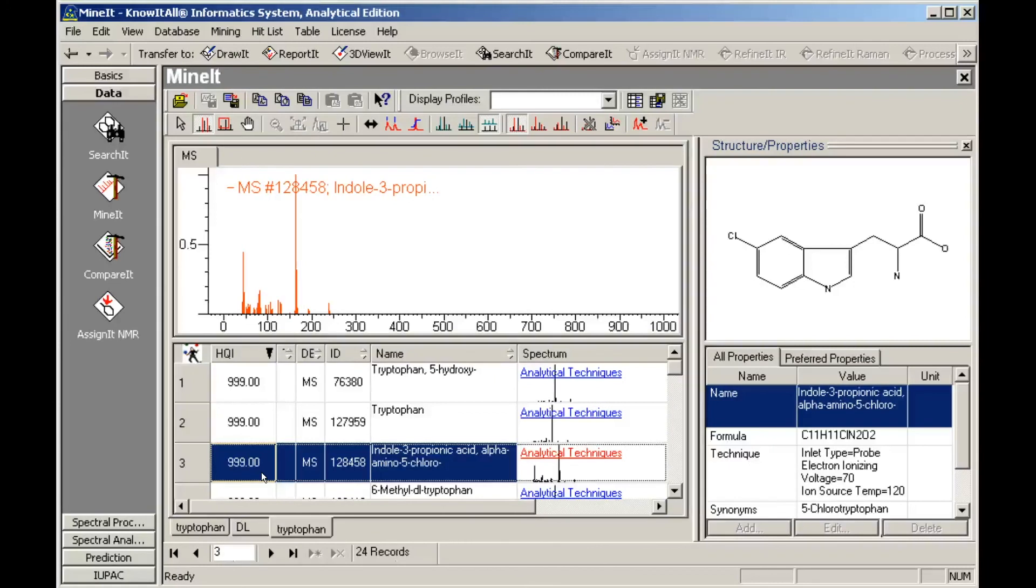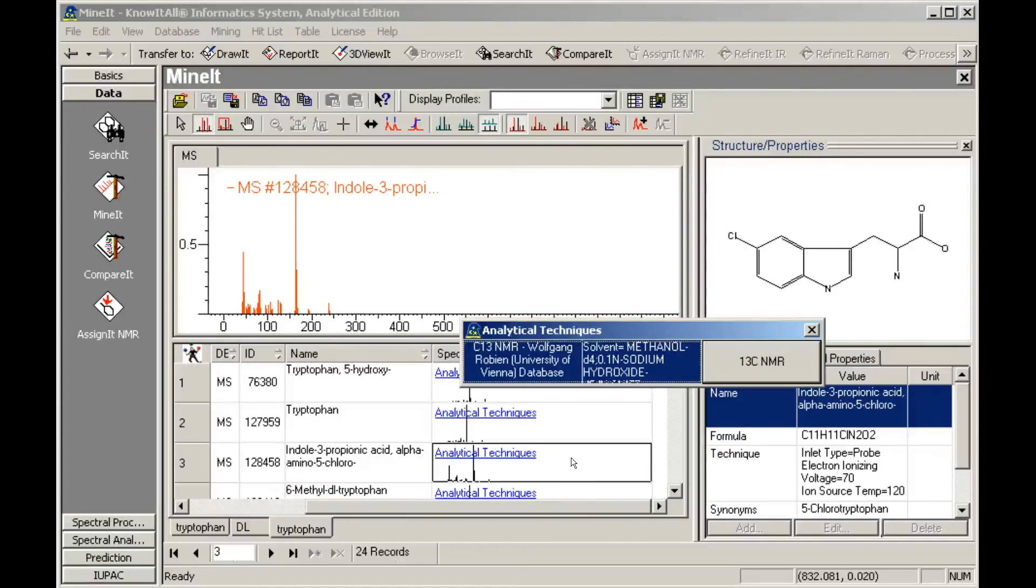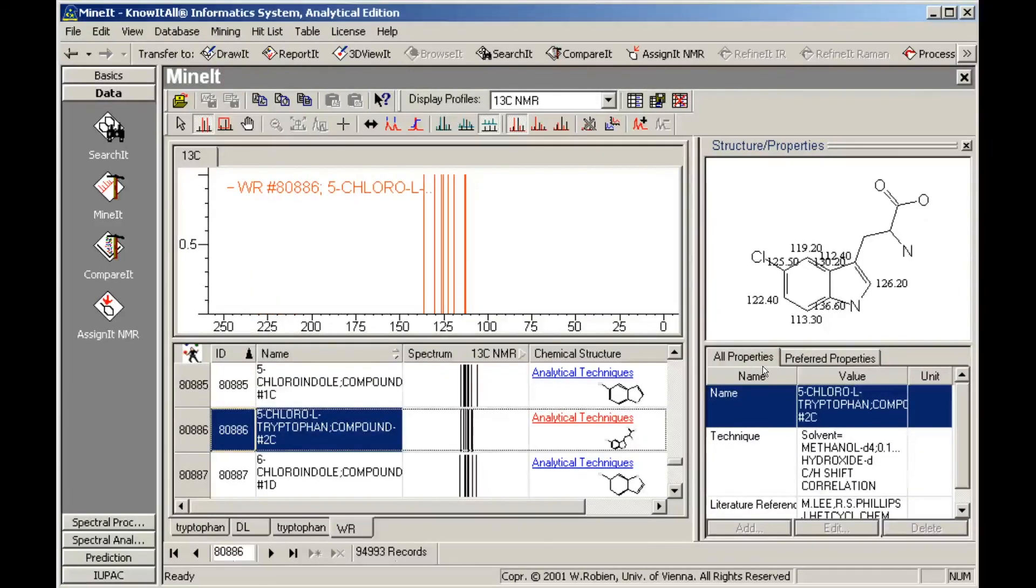Click Analytical Techniques to see what other spectra are available for this compound. Unlike the first example, only one other spectrum is available for the compound. The CNMR database opens in a new tab.